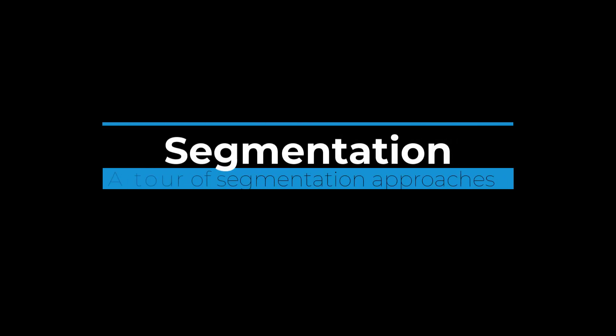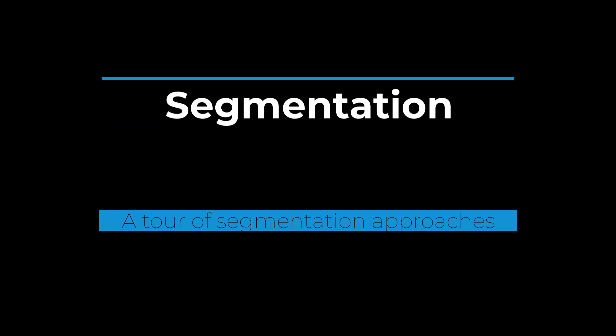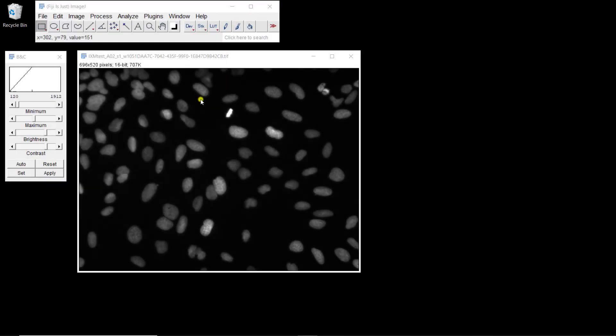In this video, I'm going to show you how you can use several segmentation methods in ImageJ to identify objects in images, to segment objects of interest.